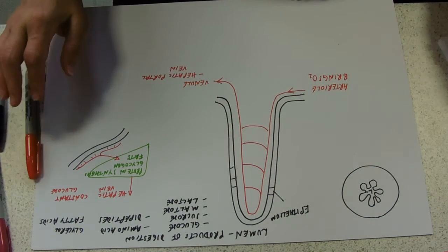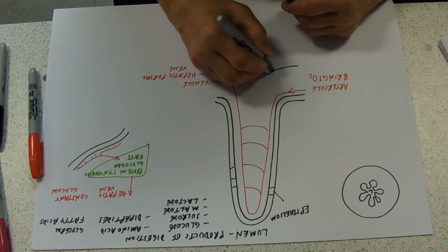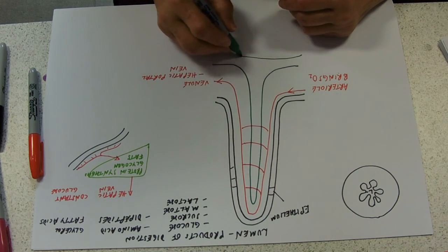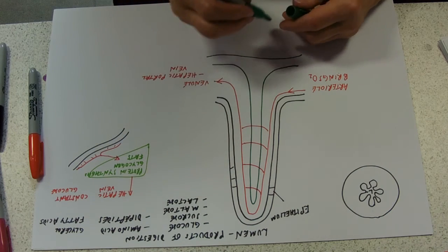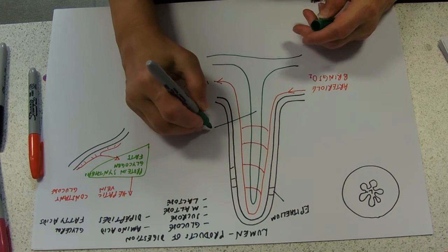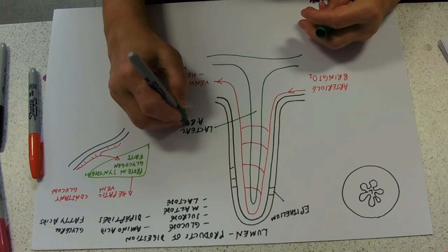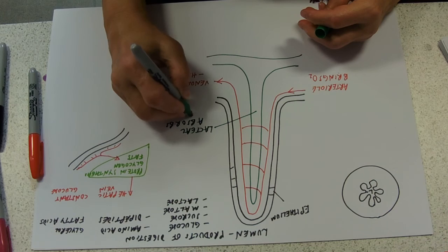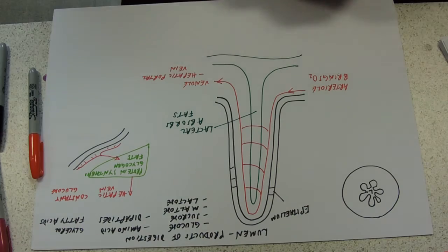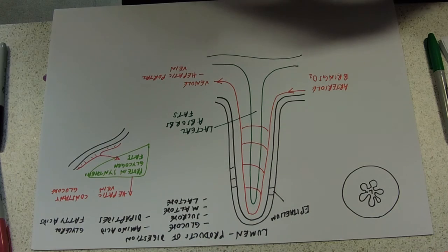The other structure that we see in the villus is a lacteal. These are called lacteals because they look milky in colour, and the reason that they look milky in colour is that they're absorbing fats. So this is a lacteal, and it absorbs fats. And the story of fat digestion is not only completely fascinating and a little bit unusual, but also something you can look up yourselves.